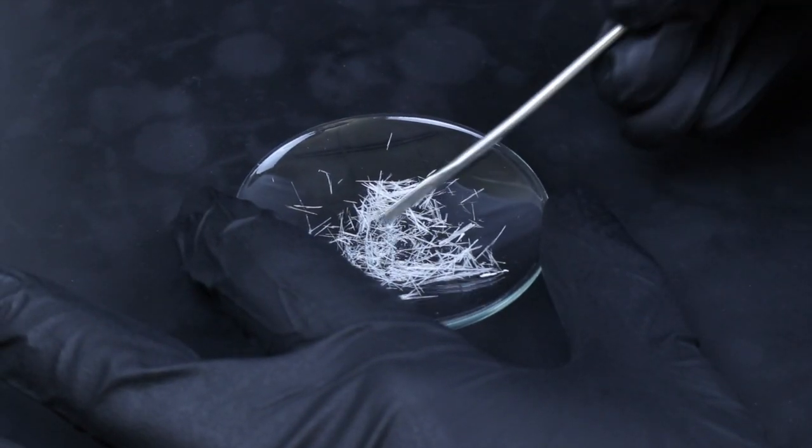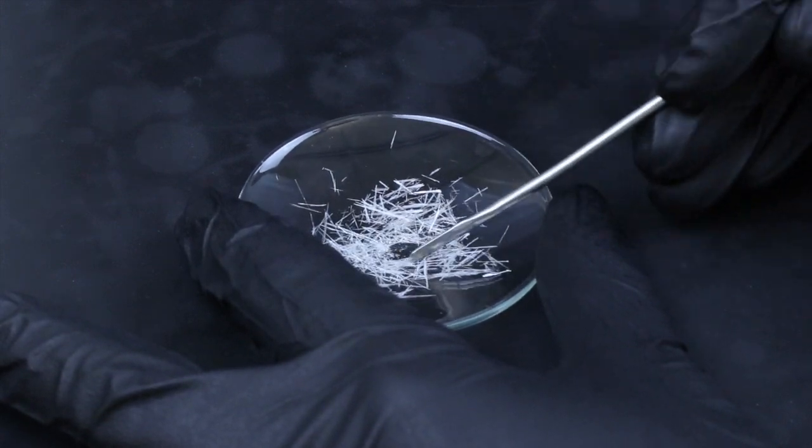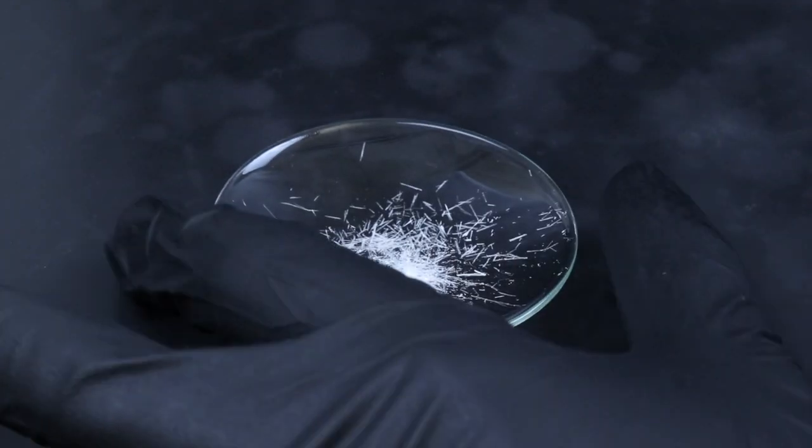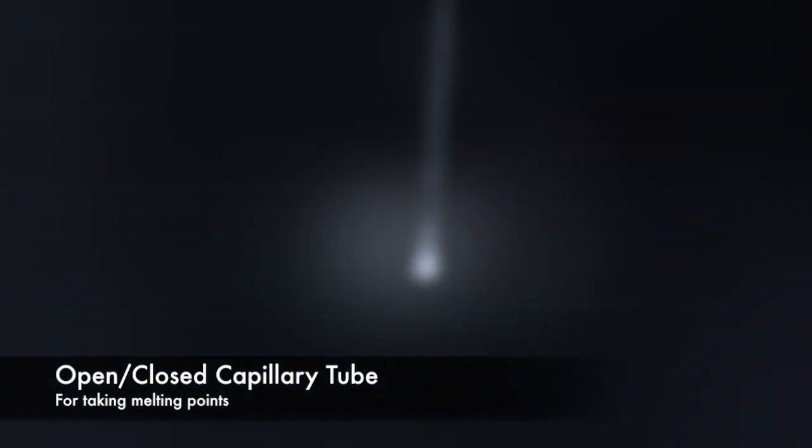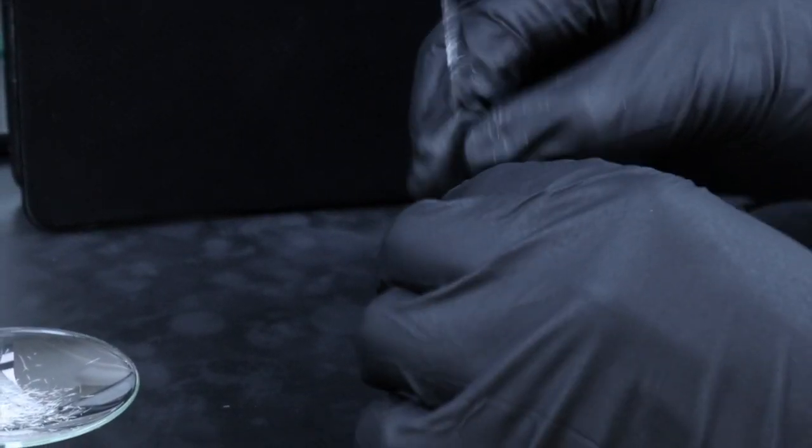Then I'm going to crush up the crystals just a little bit so it'll be easier to place them into an open closed capillary tube to run the melting point. Right now they're in the open side of the capillary tube, so I'm just going to tap it against the counter to draw them to the bottom of the closed side, and once there, it'll be ready to run a melting point now.